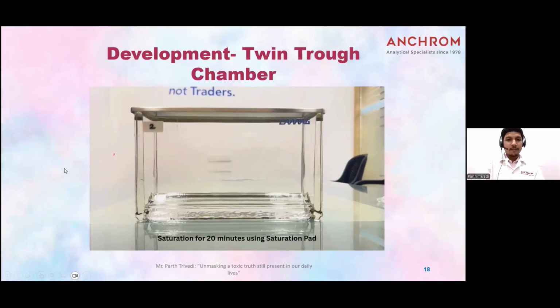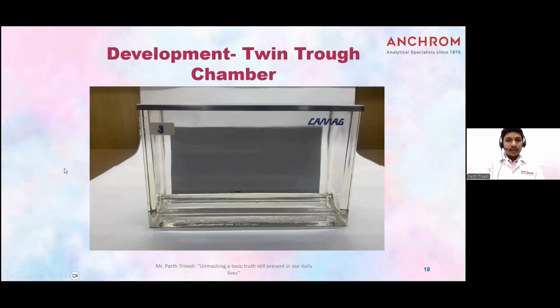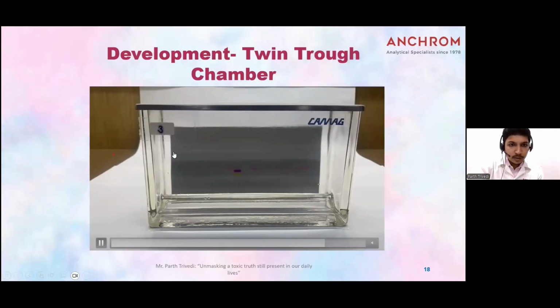And after that we place our plate, and after placing the plate you can see that the run is going on. It has already made a proper, nice gaseous phase, so that you can see the bands visibly separating and going upward, and you can see the mark over here. We have made a 7 centimeter mark here, so that we will run till that, and then remove the TLC plate.